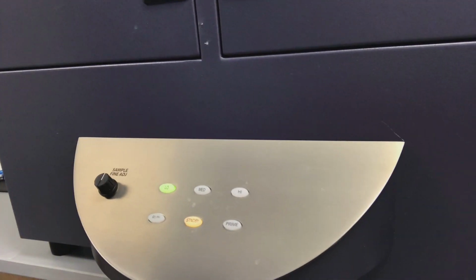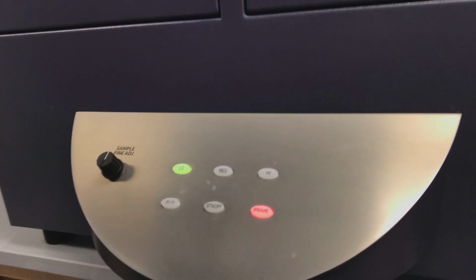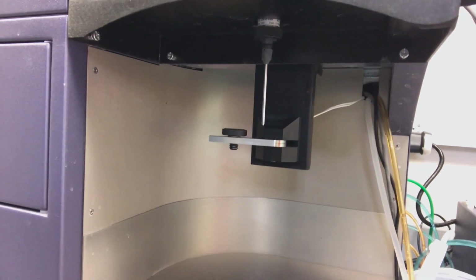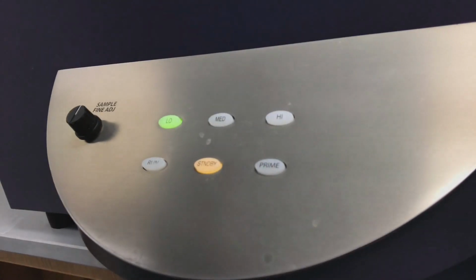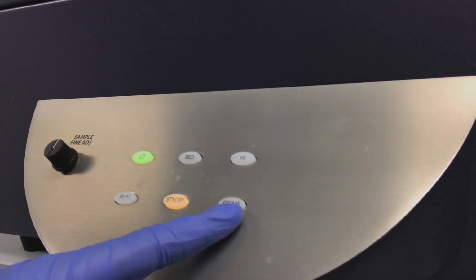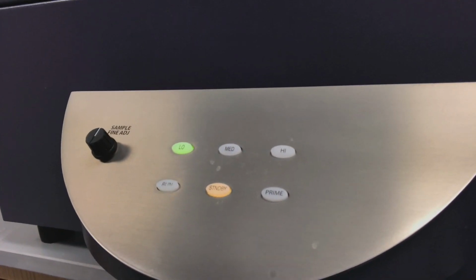With no tube loaded and the arm to the side, we can prime. It is extremely important to only prime with no tube loaded and the arm to the side, as you see here. Do not prime with a tube loaded, whether it's water, bleach, and especially not cells. After the machine is done priming, it will default back to standby. Please prime 2 to 3 times, no matter if you're the first user of the day or in the middle of the day. It's important to do this step anyways.